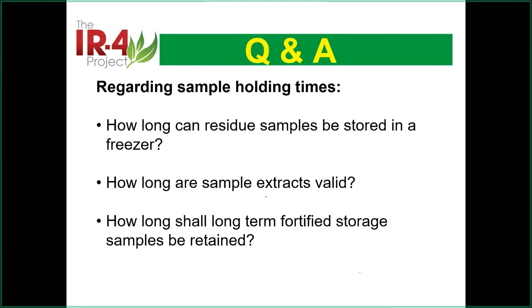So the sample extract. Again, the standard correct answer is based on your protocol, based on your SOP. But in this case, I talk about the IR4 protocol. We can read that, the IR4 protocol. So what is that?